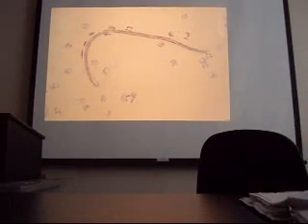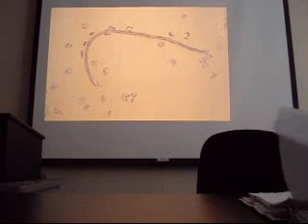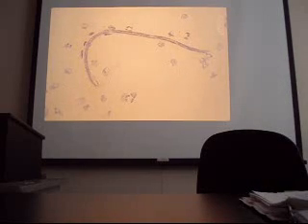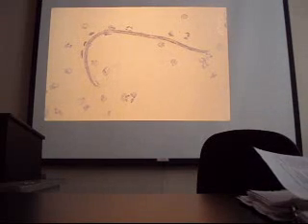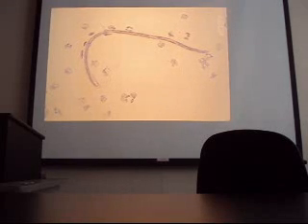Okay, we have Loa loa, the African eyeworm. The sheath looks, see this part of it right there. And then we have the tail in here. Loa loa, carried by the mango fly or deer fly. It likes the morning hours to the afternoon hours. And the body nuclei go all the way to the tip of the tail. This is the one that migrates from one eye to the other over the bridge of the nose, right? Yes.